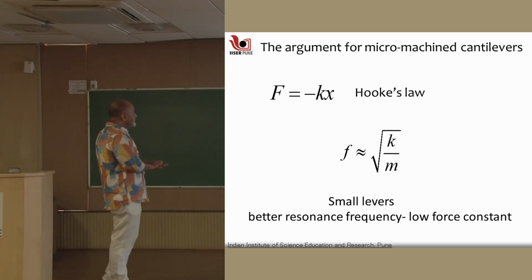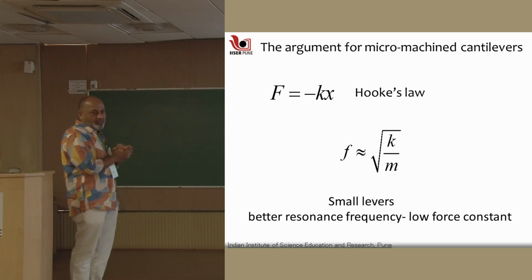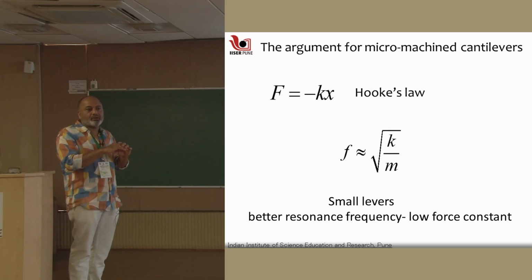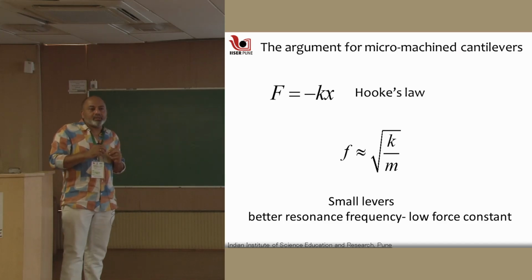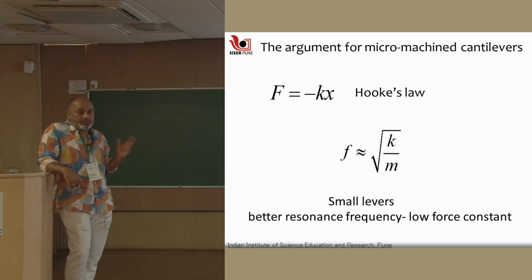And this is the problem. The cantilever is a complex object. It's not just a spring to measure forces. Normally forces are measured using a spring. This is common knowledge, right? And even now in AFM and everywhere, optical tweezers also measure forces using a spring in the end. But that spring has to be extremely weak. Okay, why does this have to be so?